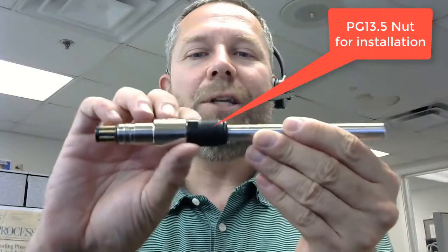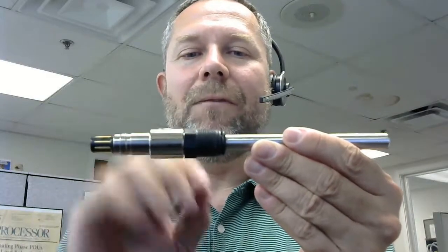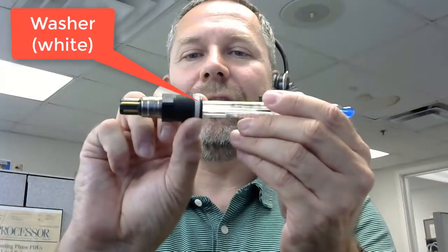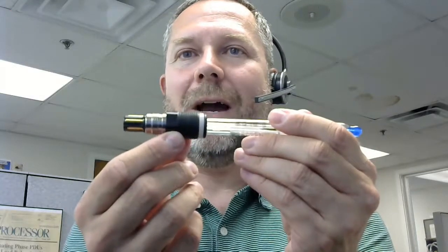We have our PG-13.5 thread. This is spinning freely on this nut that you see here. We have an O-ring, and we have a washer. This can look a little different depending on which sensor you have. Here you can see the washer is this nice white disc, a PG-13.5, and of course the VP connector.